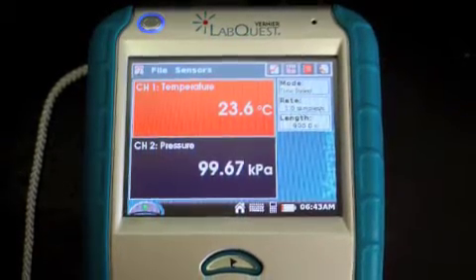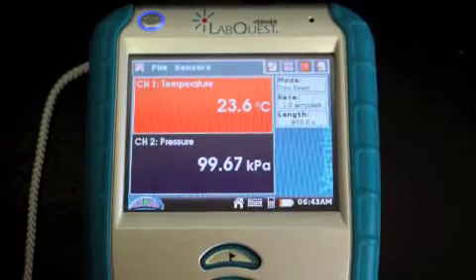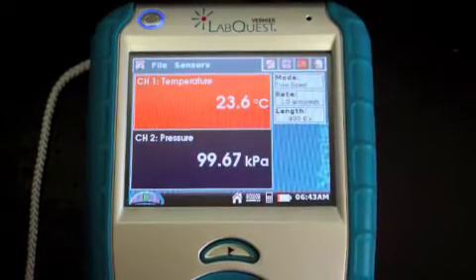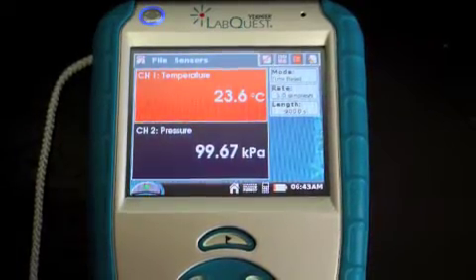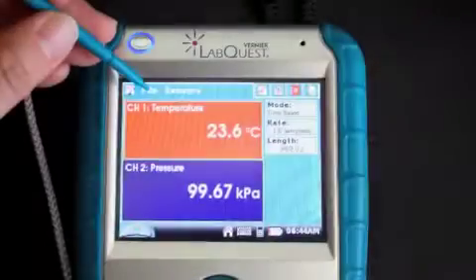The LabQuest should automatically display the temperature and the pressure readings coming from the sensors. Make sure that the temperature reading is somewhere between 20 and about 24 degrees Celsius, and that the pressure reading is in the neighborhood of 100 kilopascals. That way you know that everything is working properly.